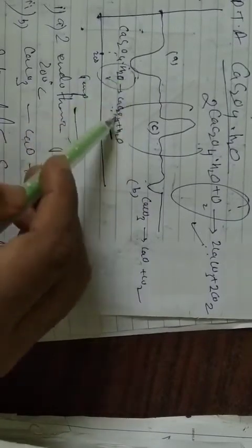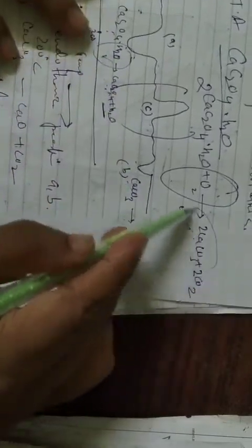So we get two endothermic peaks: the first peak is for the removal of water, and the last peak is the decomposition of calcium carbonate. In between, what you get is the oxidative peak, oxidation, okay.